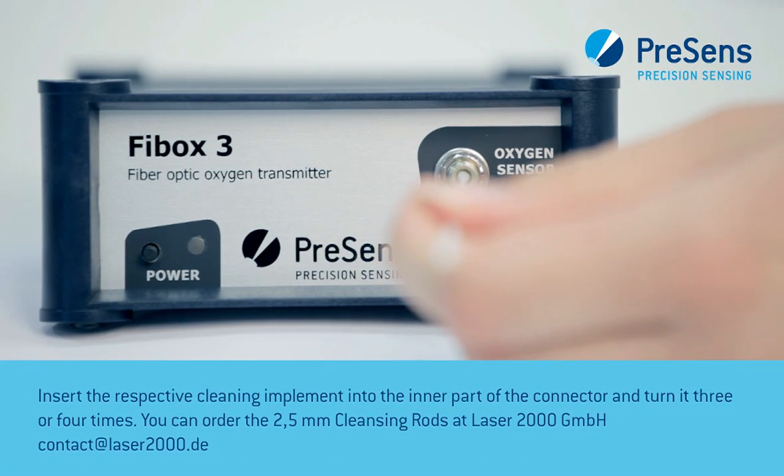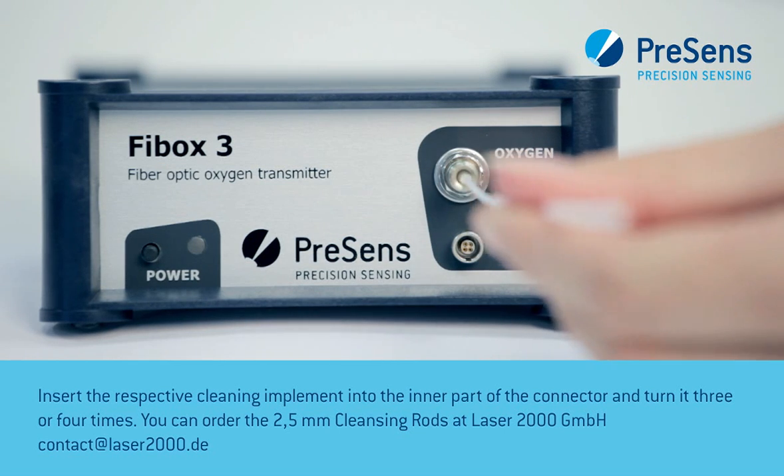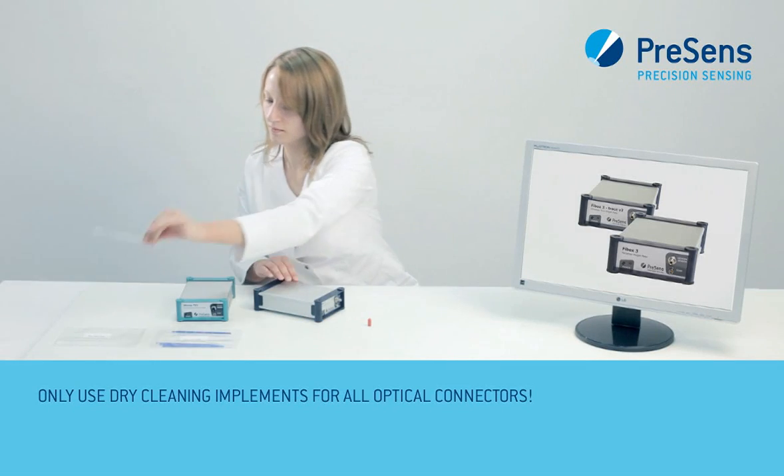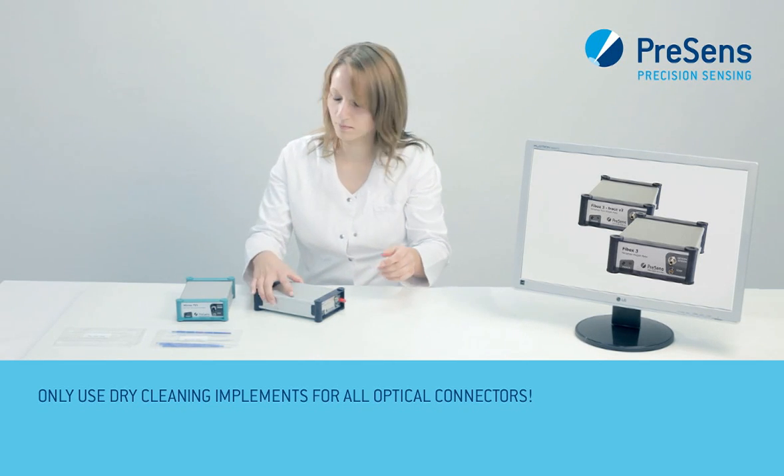Insert the respective cleaning implement into the connector and turn it 3 or 4 times. Only use dry cleaning implements for this procedure.